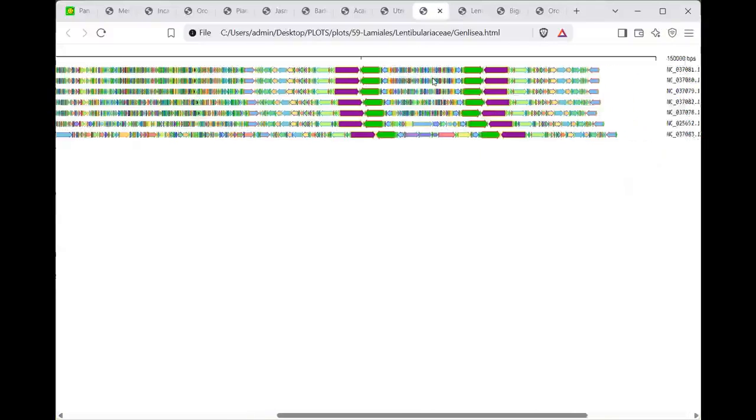So there is a lot here. We can go and dig deeper into these sequences, go check why these portions of the sequence are so dissimilar to the rest. So this is just giving you more things to check in those sequences. Maybe they are assembly errors, or maybe the plastid sequences differ quite a bit compared to the rest.